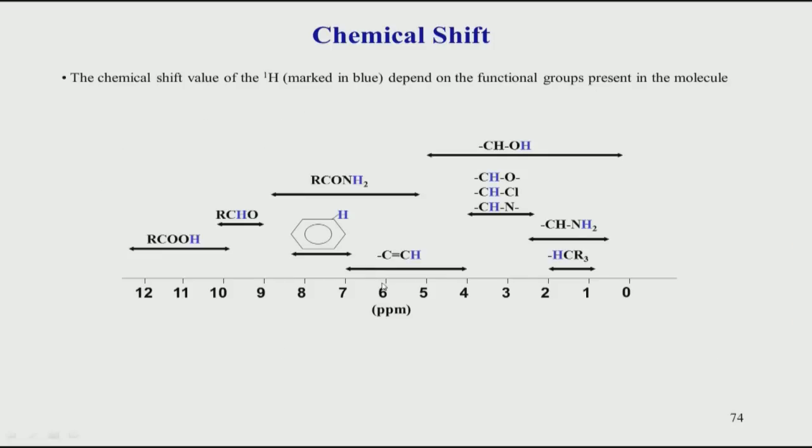The chemical shifts that you see for different functional groups come in this particular zone. This is a hydrogen spectrum, a proton spectrum. You can see here the scale is marked from 0 onwards towards the positive side, and typically this is what happens in all organic compounds. We choose 0 ppm as a reference. We will talk about the reference a little bit later. Suppose we set the reference to 0, then all the typical compounds studied in organic chemistry fall on the downfield side compared to 0. That means anything more than 0 is shifted downfield with respect to the reference.